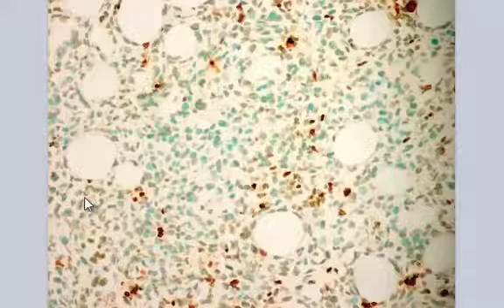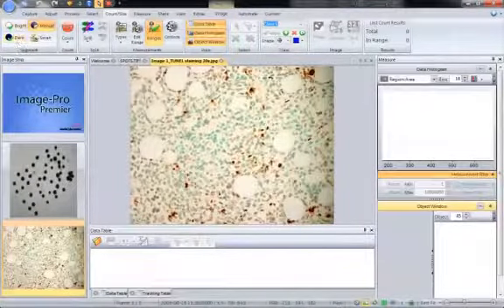Now in this case what we have is we have relatively dark objects on a relatively bright background, but we now have two different types of objects. We have those blue objects and also those brown objects. We also have a problem with shading in the right hand side of the image. In this case, we can no longer select just bright or dark objects. The shading and the color will get in the way.